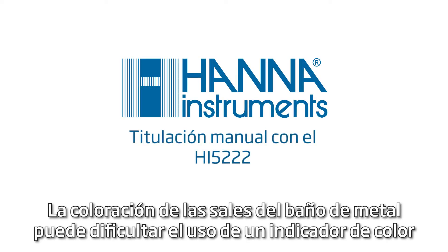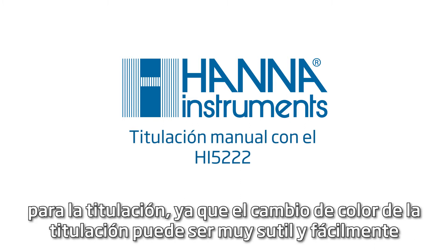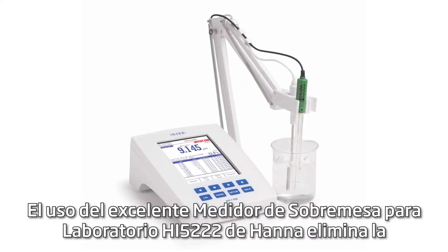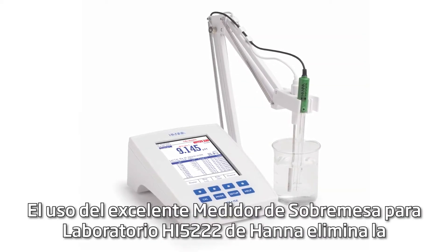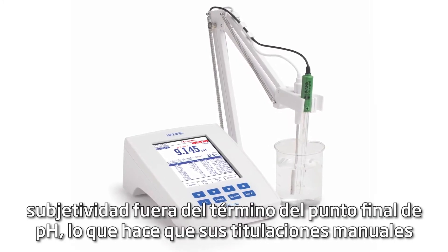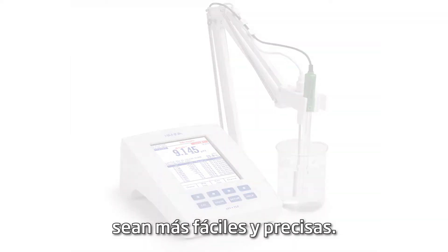The coloration of metal bath salts can make using a color indicator for titration difficult, since the titration's color change may be very subtle and easily masked by the plating bath's color. Using the HANA HI5222 laboratory grade benchtop meter takes the subjectivity out of determining the pH endpoint, making your manual titrations easier and more accurate.